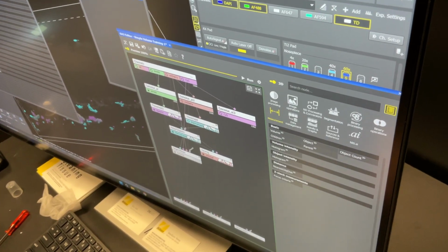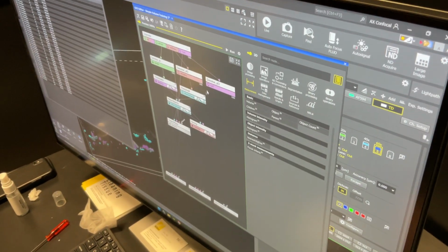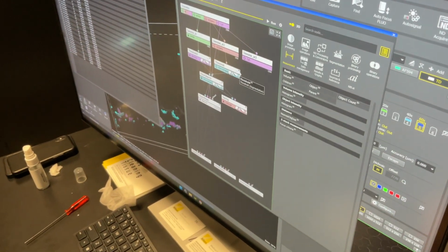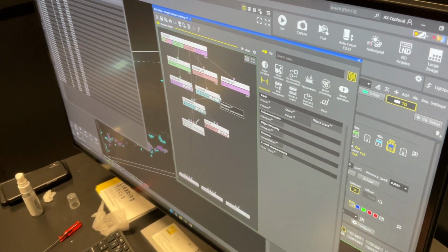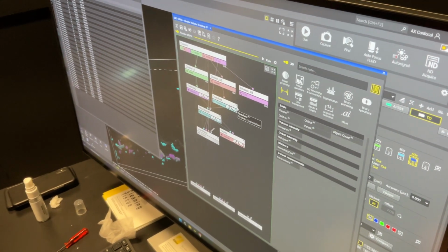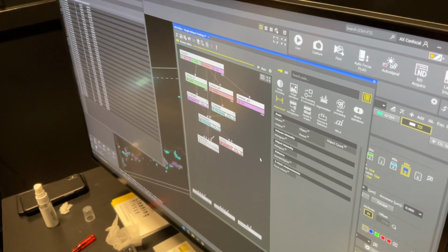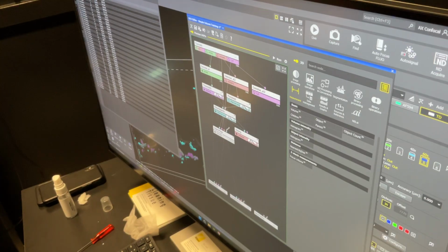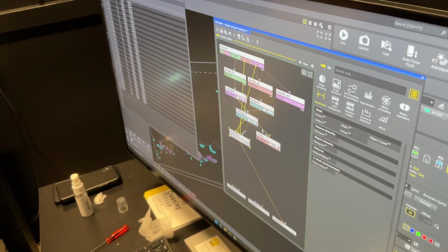The other thing I would probably want to do is look at the engulfed bacteria and ask what's the intensity of the third channel. Like in Imaris, I made a co-localization channel of red and green, and then asked what's the intensity of that channel? Here you'd just be using your masks. You take your measurement and point it towards the channel that you want to measure.